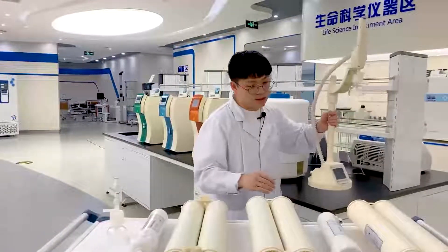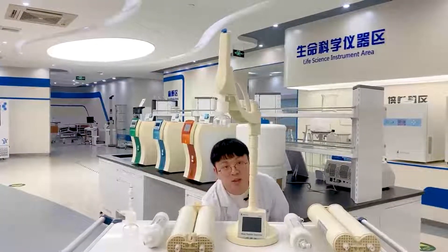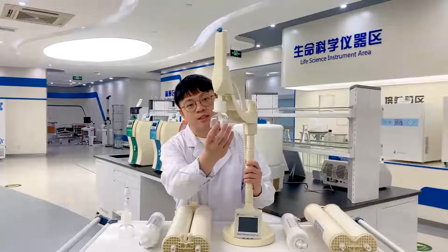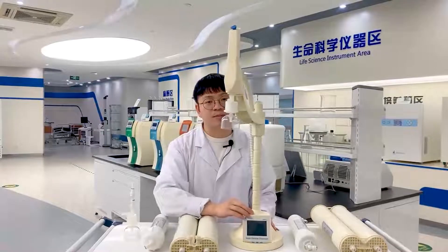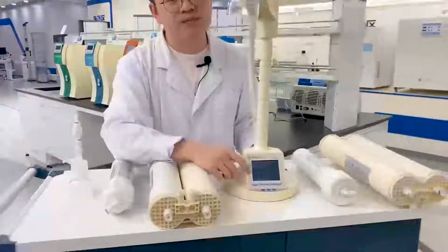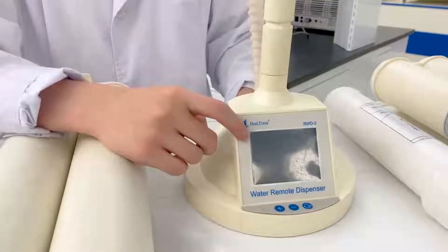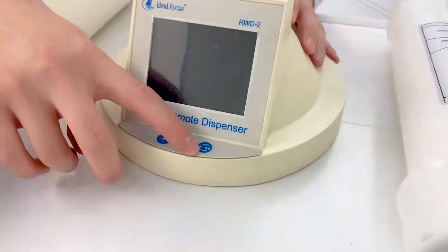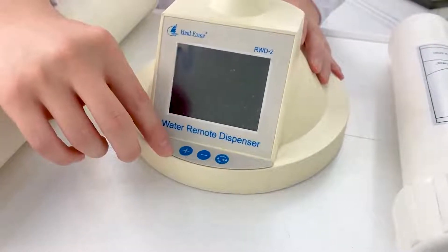This is our remote water dispenser. It has a final filter on it. For the Smart Plus series, it has a screen where you can view the water status. One control is for volume and another is for water flow speed, so you can control dispensing from here.